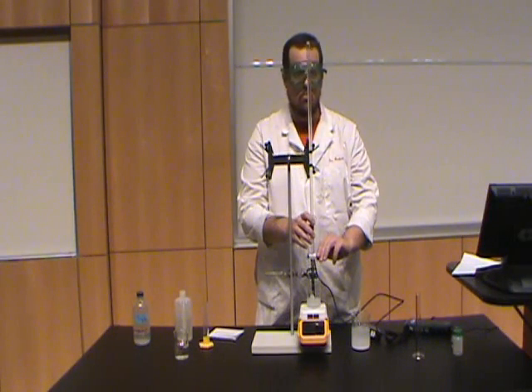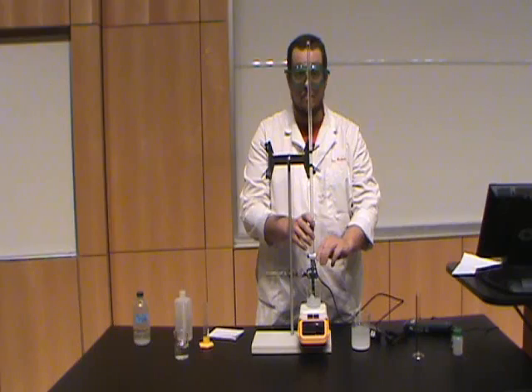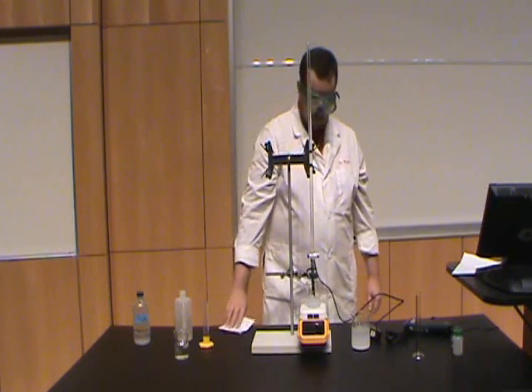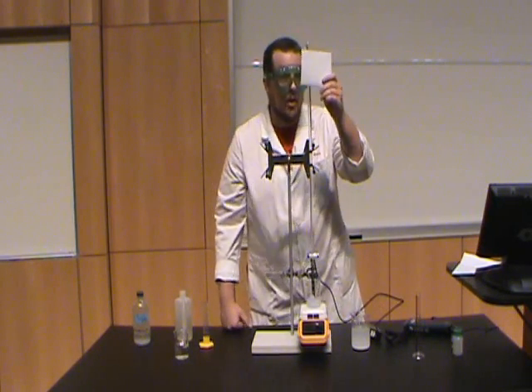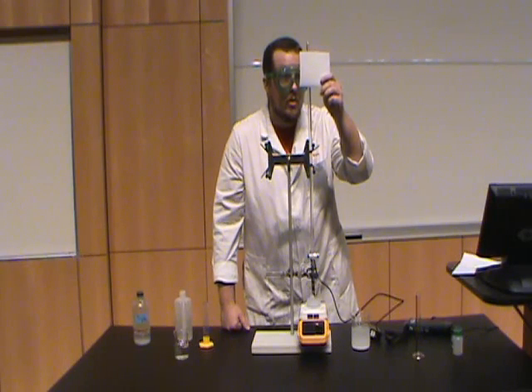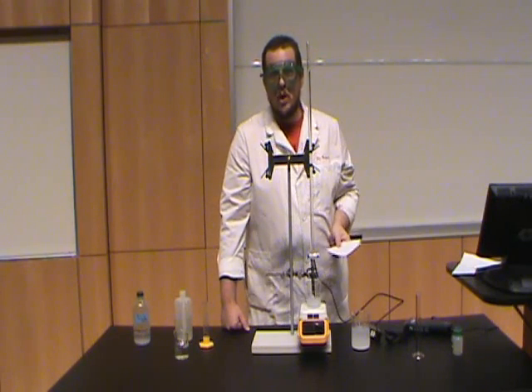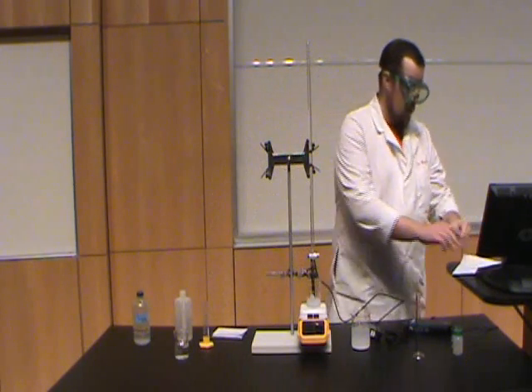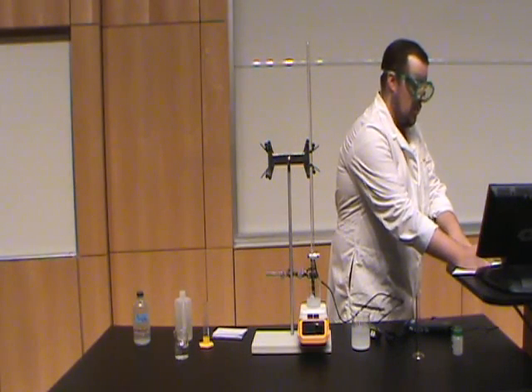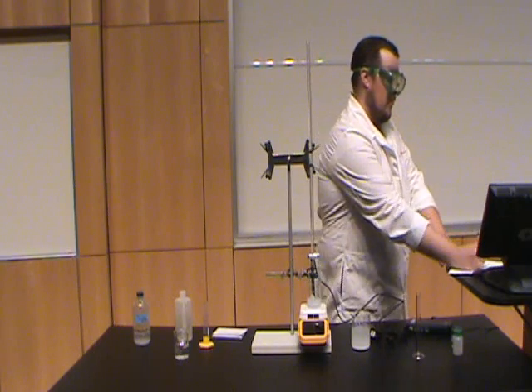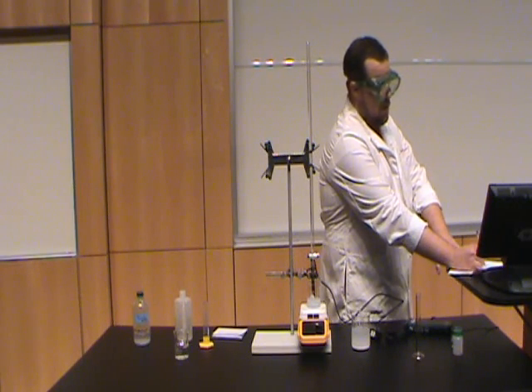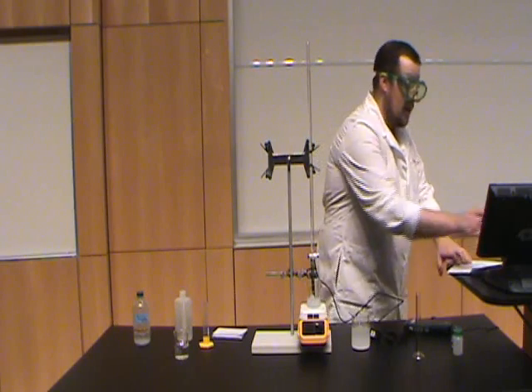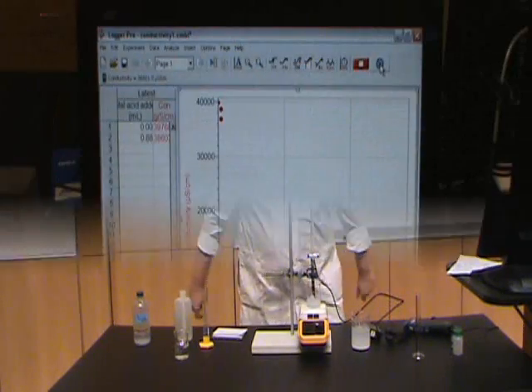Add a little bit more. Take another reading. We're at about 2.12 milliliters. So, 2.12 milliliters is our reading. That means subtract 0.33. That means we've added 1.79 milliliters.